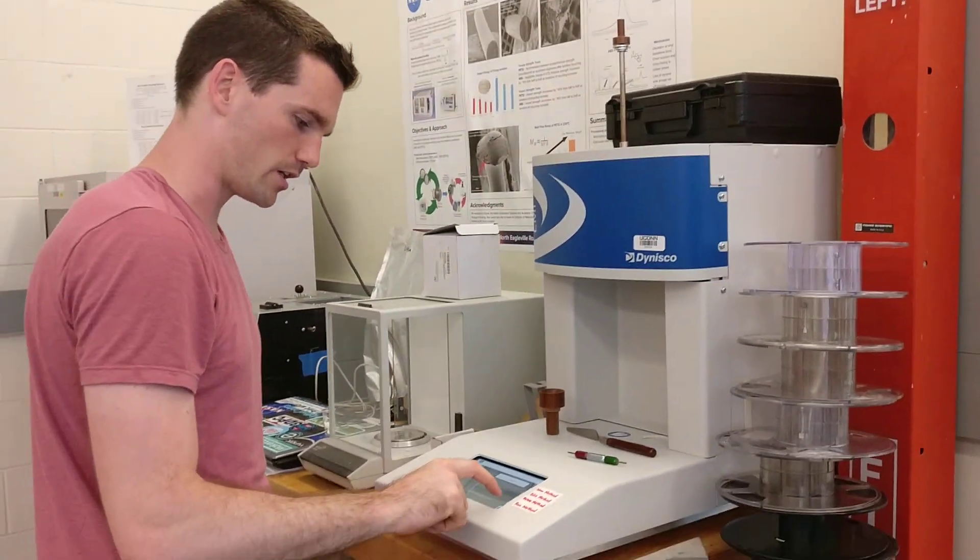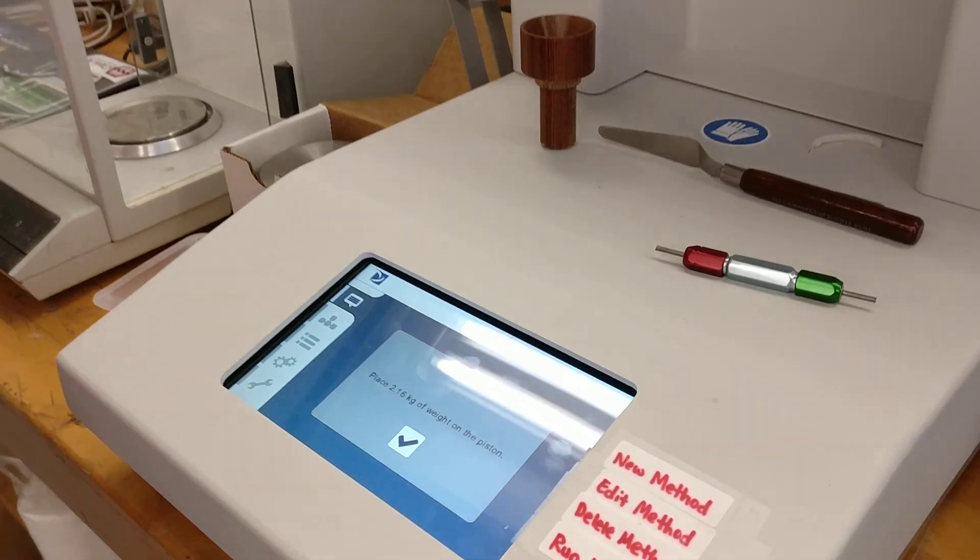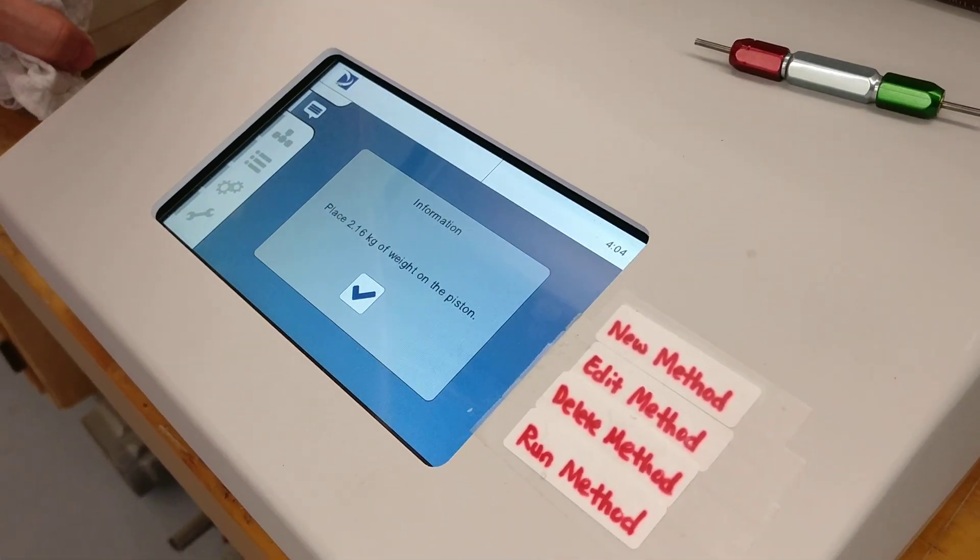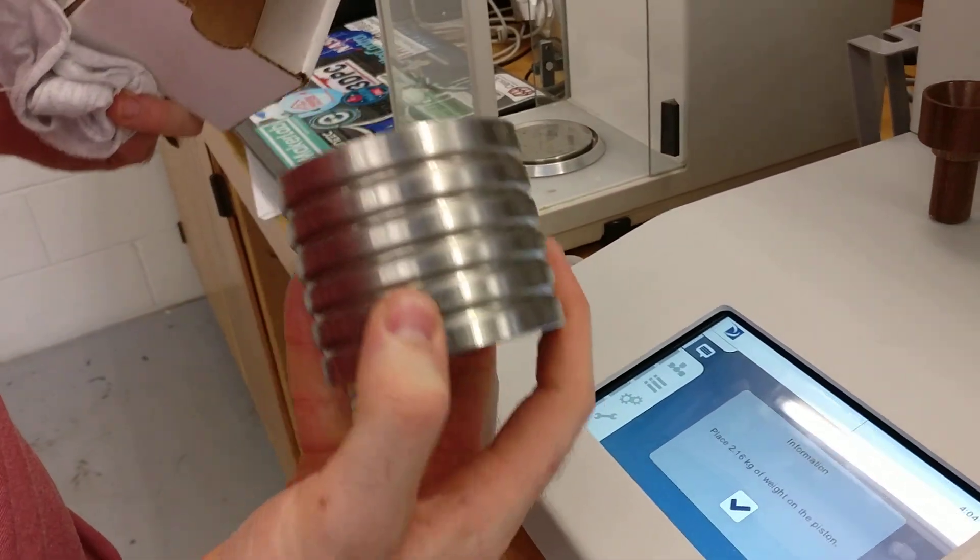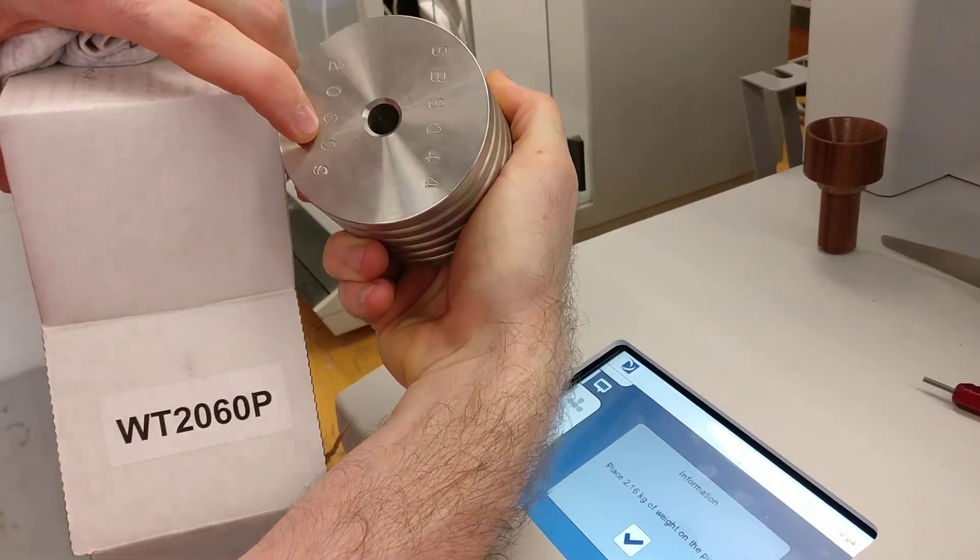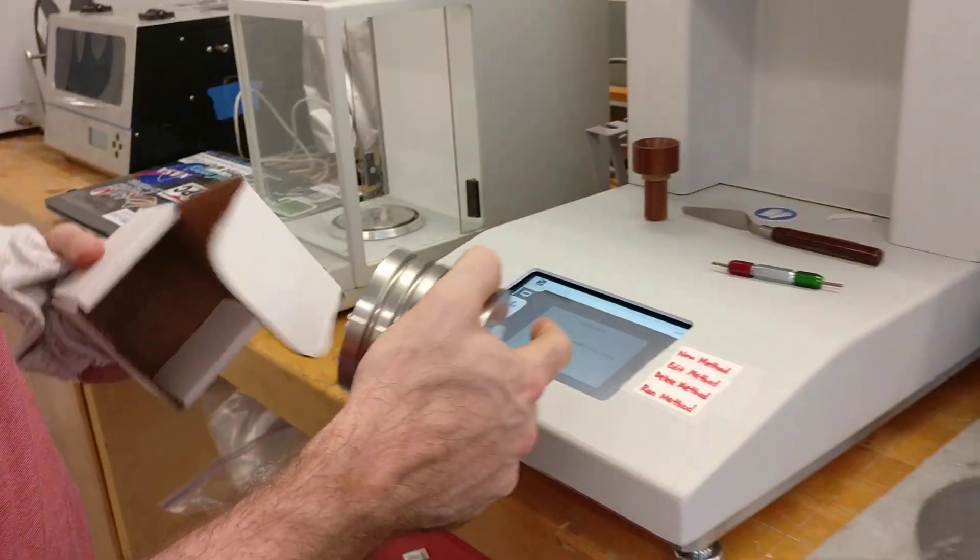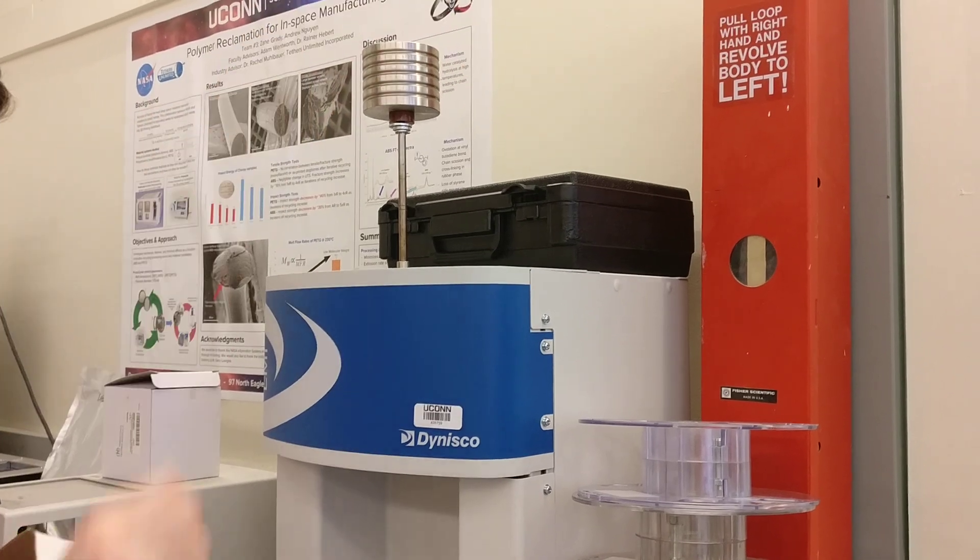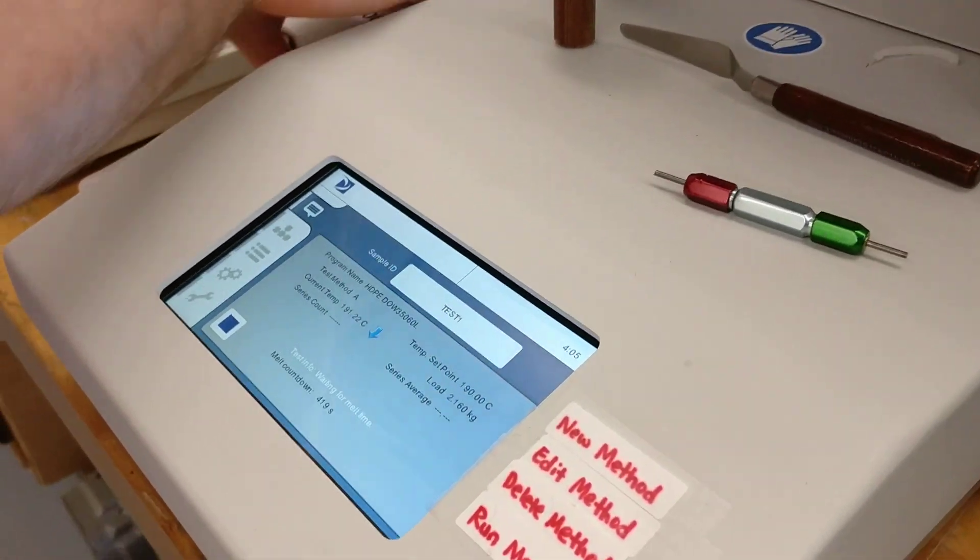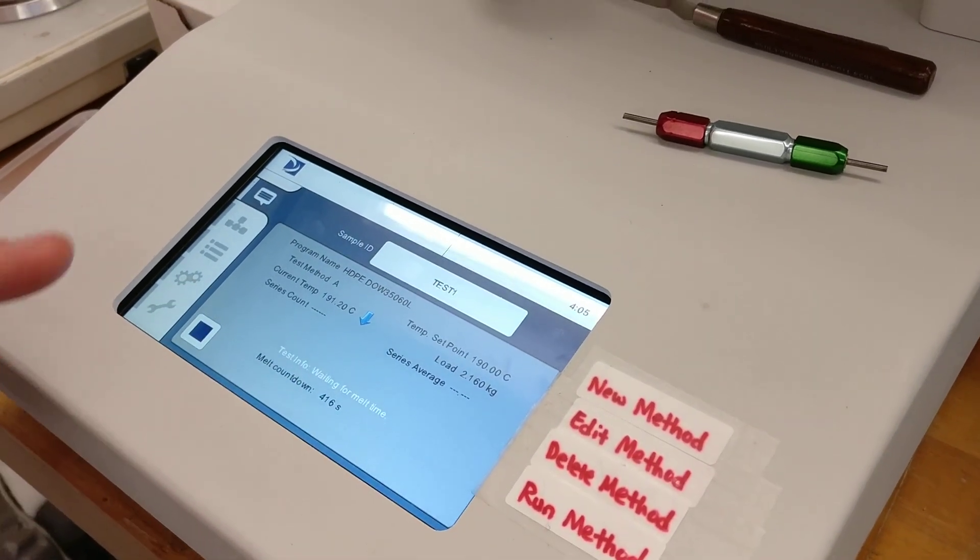Push the bottom right button after you've packed the material. It's going to say to put the weight on top of the piston. Grab the 2.16 kilogram weight. This is actually 2.06, and the piston itself is 100 grams. Put that on top, and then we're going to wait for the melt time to reach zero.